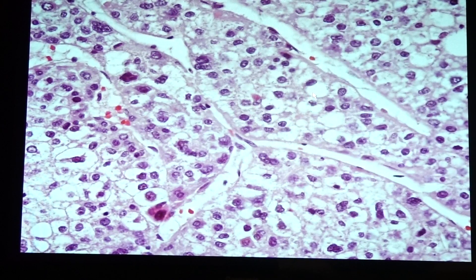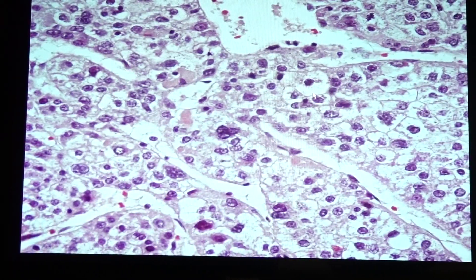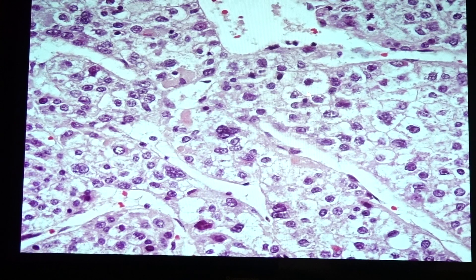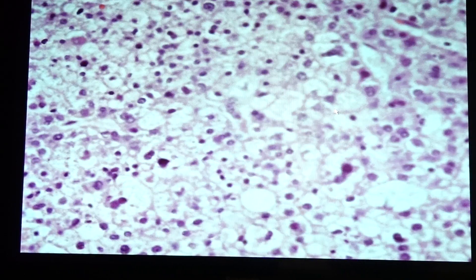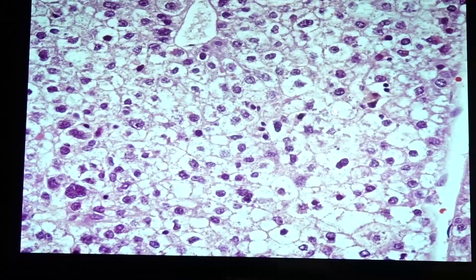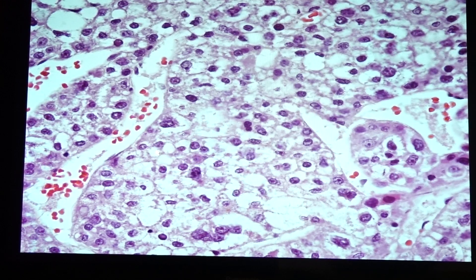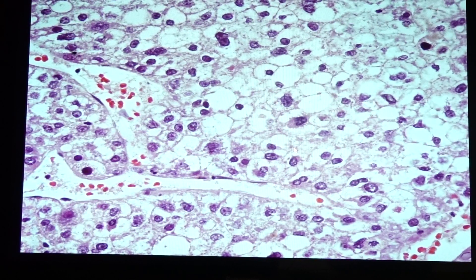Very prominent in this slide is the thickness of the liver plates. Regarding mutations, p53 is seen in 60% of cases and beta-catenin in 40% of cases. The tumor marker used for hepatocellular carcinoma is alpha-fetoprotein. The key markers are thick trabecular sheets — more than three liver cell plates — plus pleomorphism and hyperchromaticity.